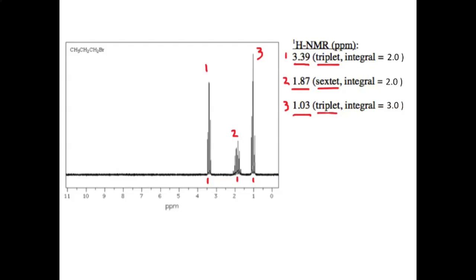That's called a triplet. The other information we need to know is the integral, and that value is given here in the table. It's 2, 2, and 3.